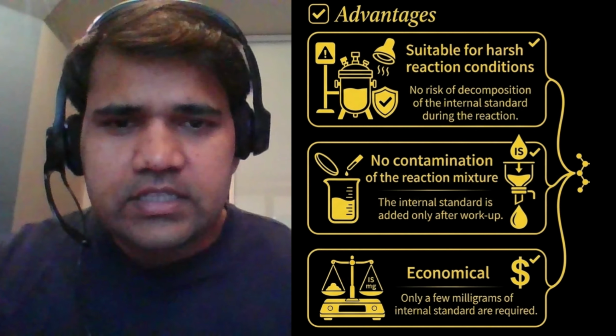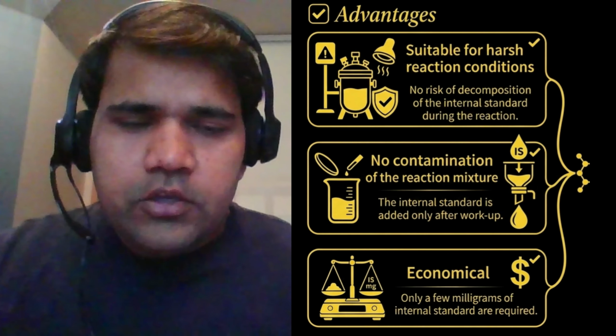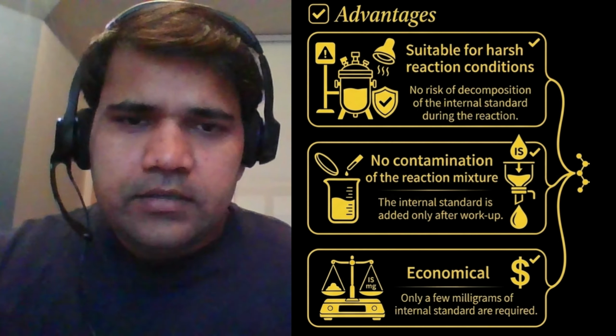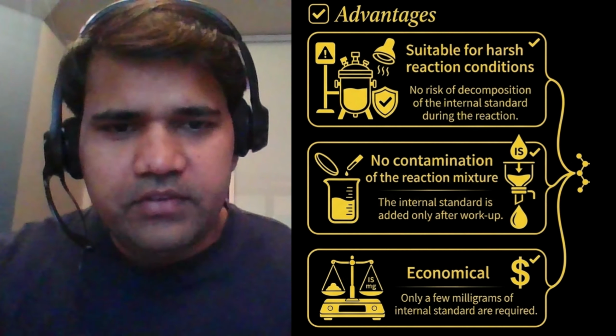And the third advantage is that you are using only milligrams of the internal standard. In the previous method, you needed to add an equivalent amount of the internal standard, which could be higher according to the amount of the starting material. So therefore this is economical and convenient.